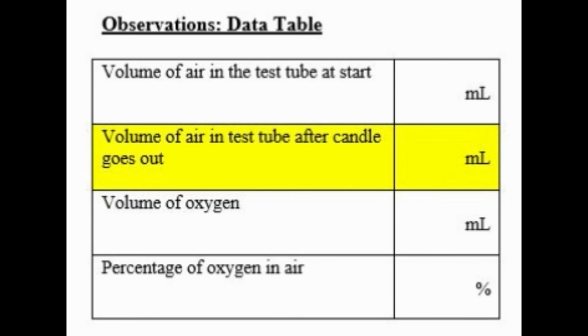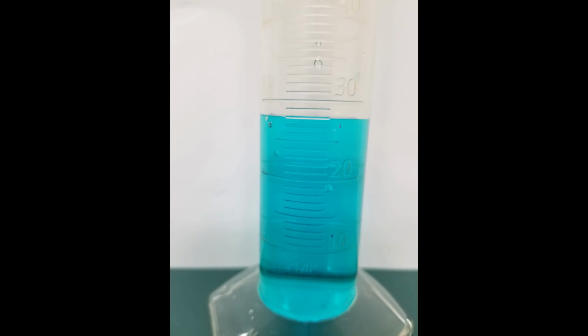Your measurement is the volume of air in the test tube after the candle goes out. Pause the video to record the volume in the appropriate place on your data table and then resume the video.